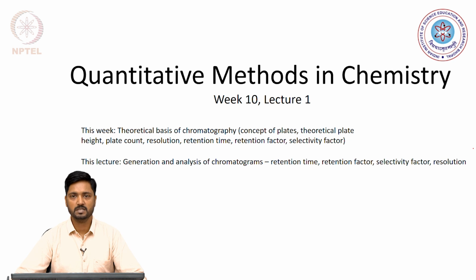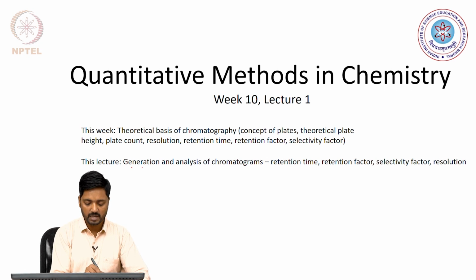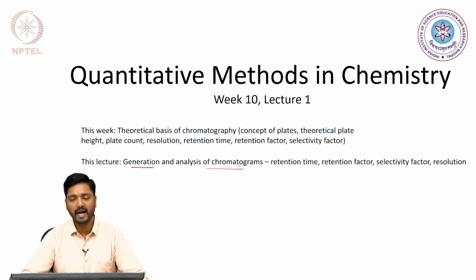We will be understanding terms like the theoretical plates present in a column and the plate height, the concept of plate count within a column, resolution of the peaks, retention times, retention factor and selectivity factor. So, this part of the lecture will focus on the generation and analysis of chromatograms, and we will get an understanding of what we imply by retention time, retention factor, selectivity factor and resolution of the peaks. So, let us get started with this lecture.